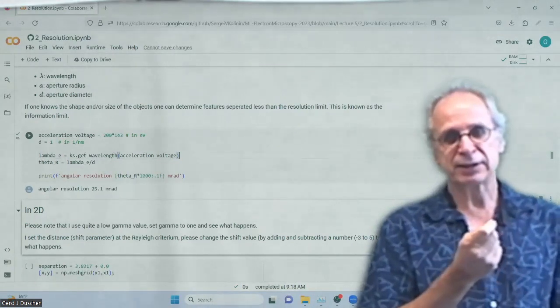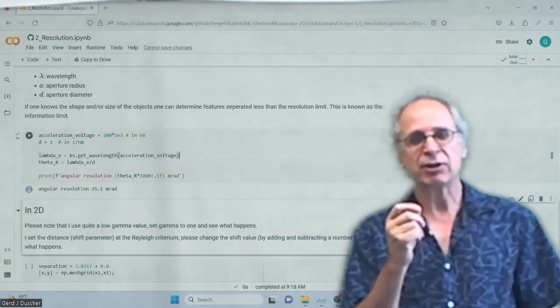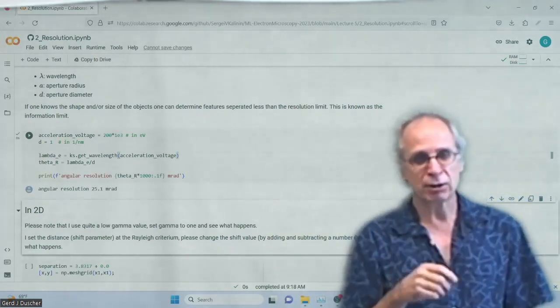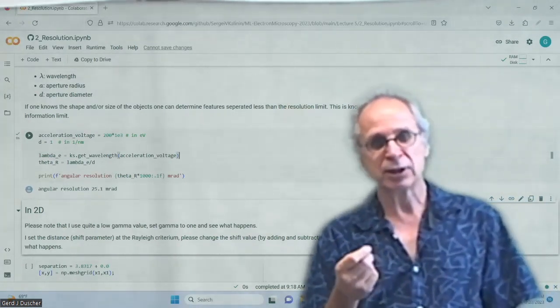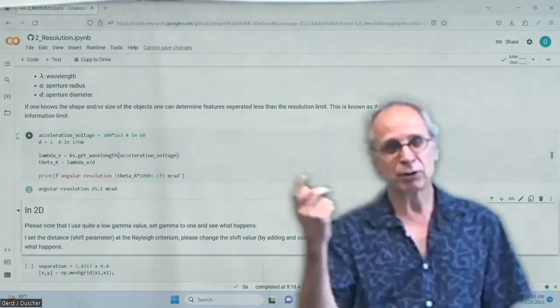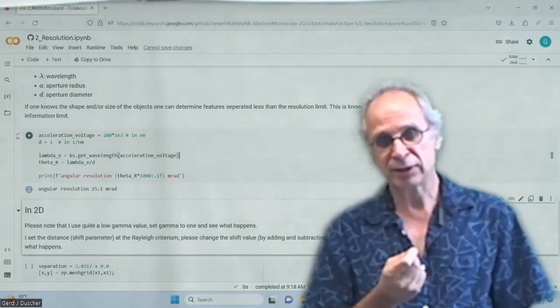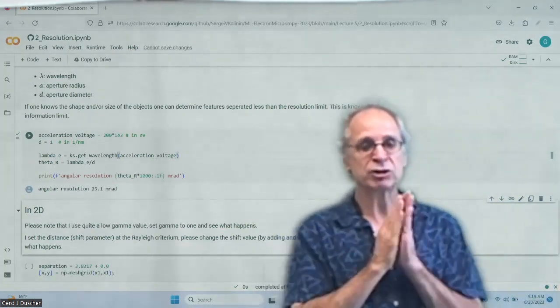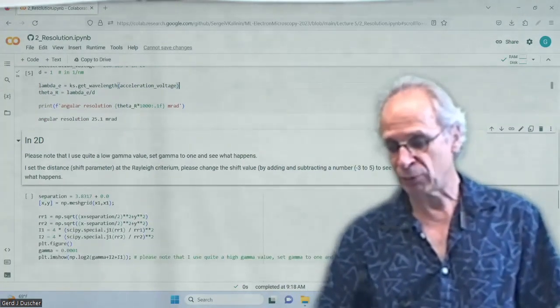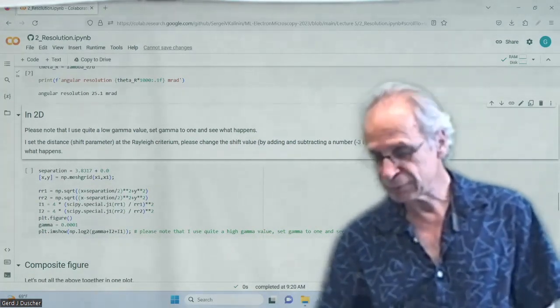In optics, the best thing you can do is possibly discriminate that there is a window in the space station. The angular resolution, in contrast, of an electron microscope: if you have a penny on the moon, you can actually discriminate the mint date, right? So the angular resolution is just so much better in an electron microscope. Obviously, you cannot look at the moon.